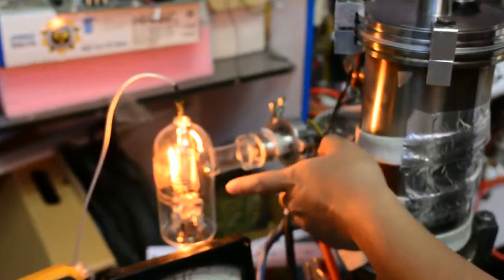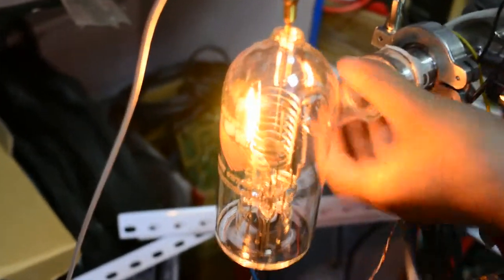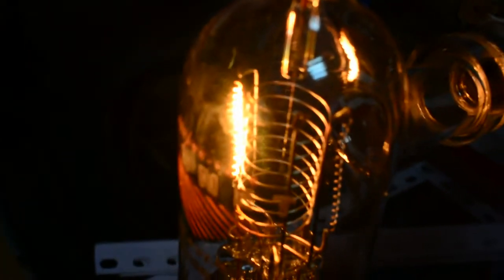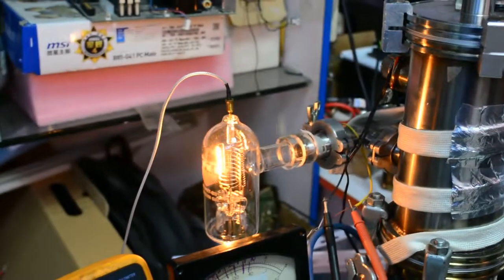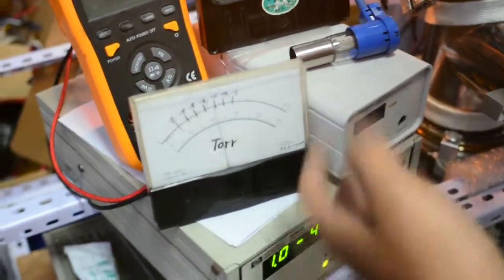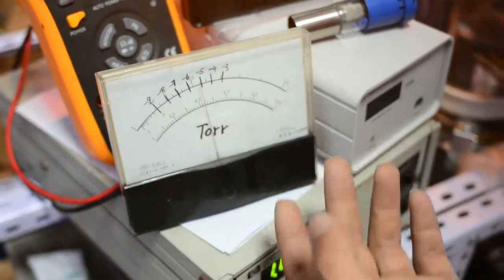This is because the tungsten filament in the high vacuum ion gauge will vaporize a little bit, which can cause the vacuum chamber pressure level to rise slightly. Once the roughing pump or turbo molecular pump evacuates the tungsten vapor out of the bulb, the two gauge readouts will line up. Basically, I'm not going to use this Pfeiffer vacuum gauge a lot because it's very complicated to use.